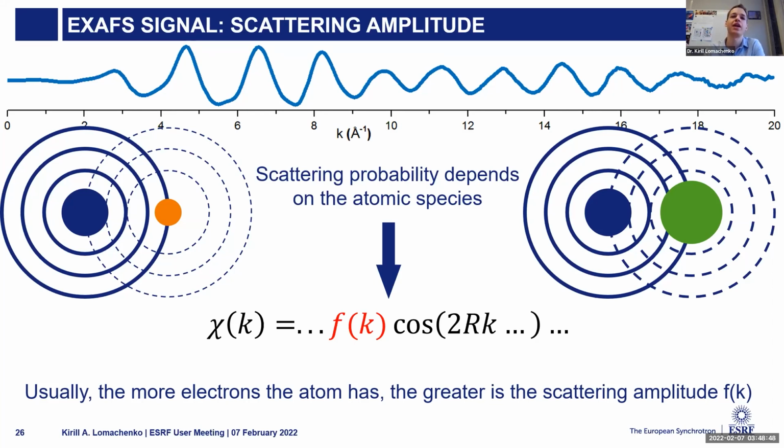But also, it's not just a scaling factor. The scattering amplitude depends also on k. It's a function of k.